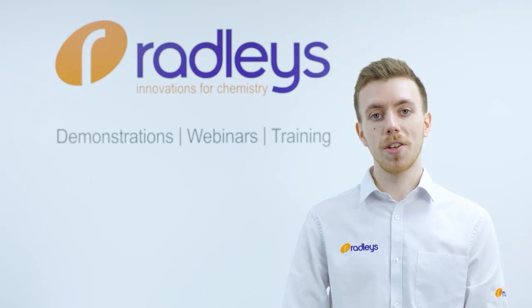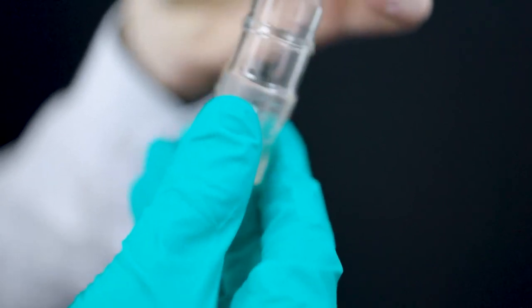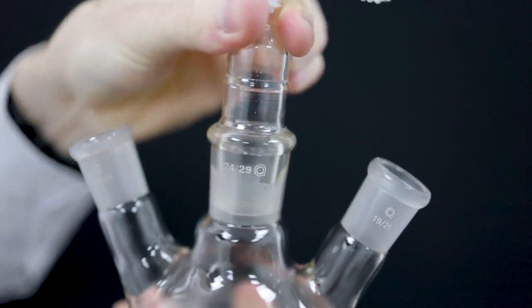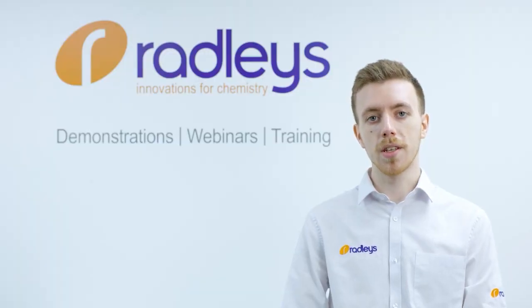As with most things, prevention is better than the cure. When using standard ground glass joints, some common advice is to grease the joints or use a PTFE sleeve. Greasing the joints between the sealing faces can help, but the grease may dissolve in your solvents or it can work its way out of the joint during your experiment. You can reduce the chance of this by not applying grease to the bottom part of the joints.